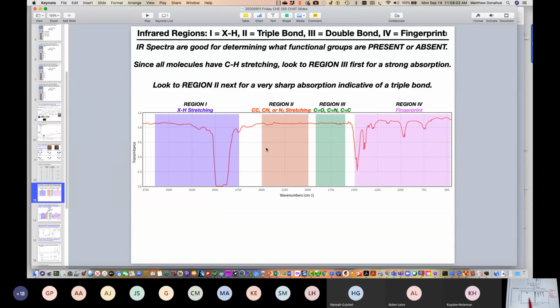Notice that what the IR spectrum does not tell you is how any of the elements in this molecular formula are bonded to one another, other than these diagnostic peaks. So what does this diagnostic peak belong to? A carbonyl. There you go, carbonyl, C=O double bond. That's 1 degree of unsaturation. So by looking at the IR, there's a carbonyl that accounts for 1 degree of unsaturation. The molecule total has 2 degrees of unsaturation.